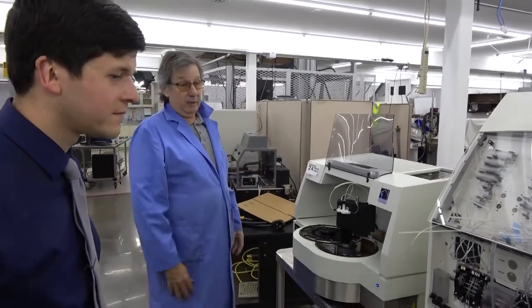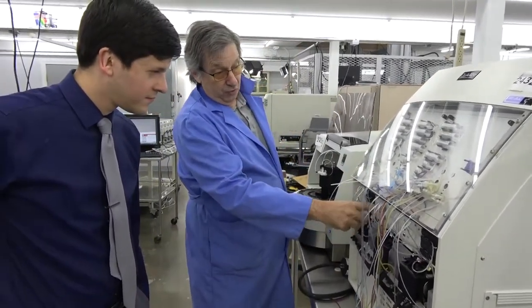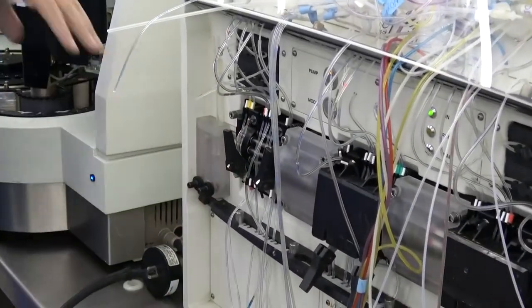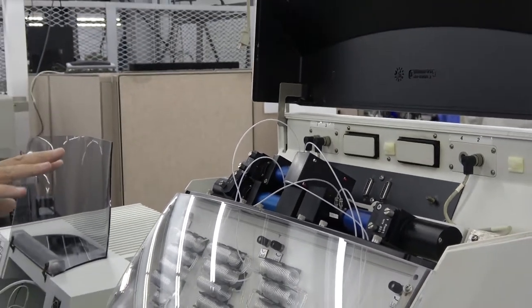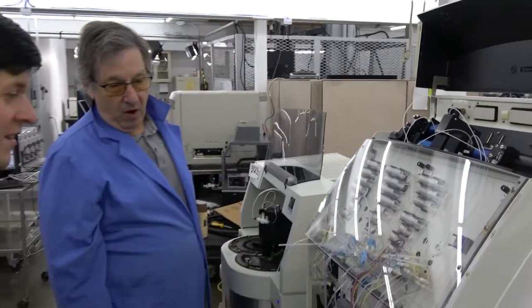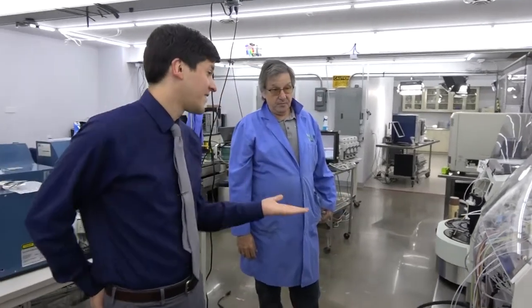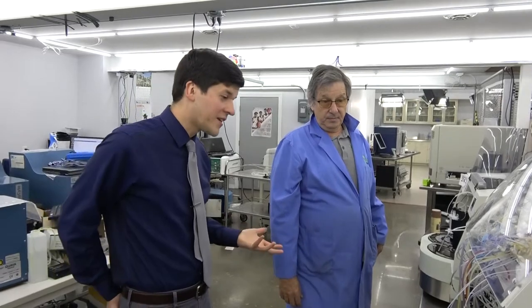Those are the things we try to describe on a unit. Same on the pump unit — we describe what buttons work, what don't work, levers, the cleanliness of the unit. If we can open them up, we try to tell you about the lack of spills or, you know, run-for-your-life flood damage. Because even an untested system is handy to somebody. There's not a lot of these systems floating around in the used market. At least if you've got somebody giving you a thorough inspection and offering a warranty, you've got a safe place to dabble if you want to add a line or replace a unit.